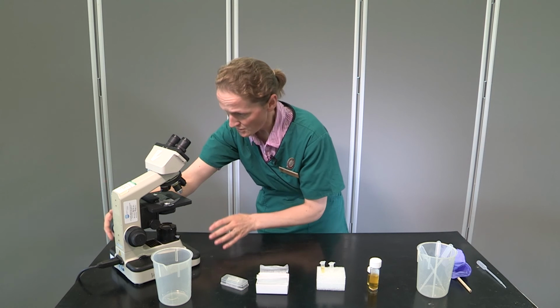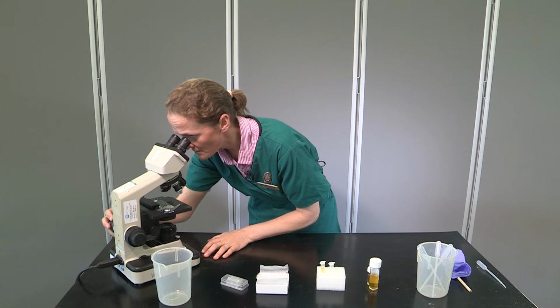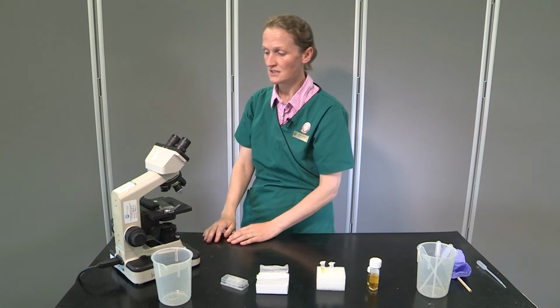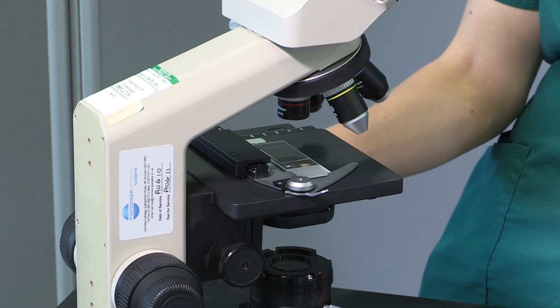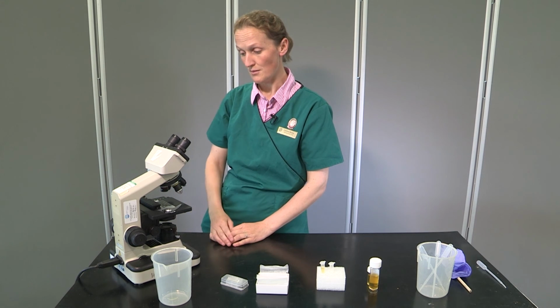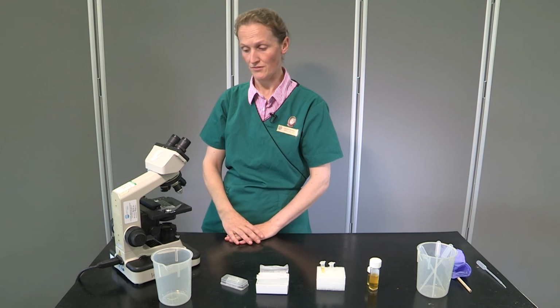Once I've brought it up to the top, I then bring it down as I'm looking through the microscope till I can see the crystals, and then I use the fine focus to focus in on my slide. And at that stage I then use the directional controls to do a systematic exam of the urine sample. And that's what I would do to prepare for urine sediment.